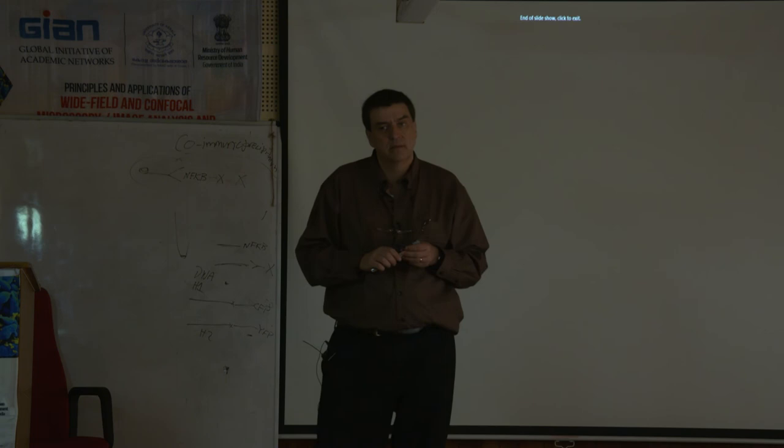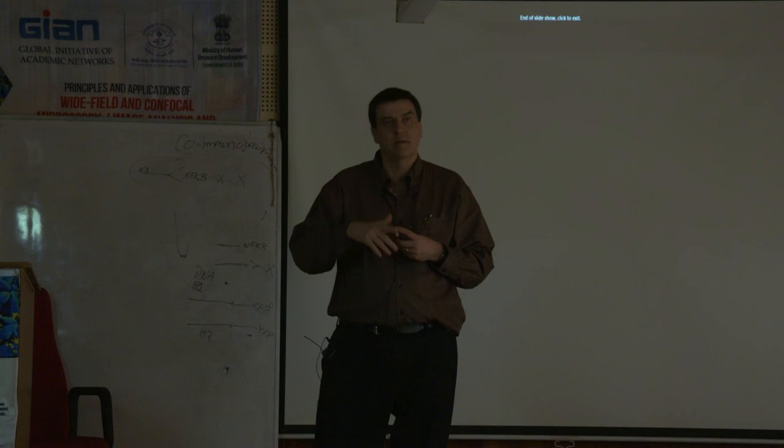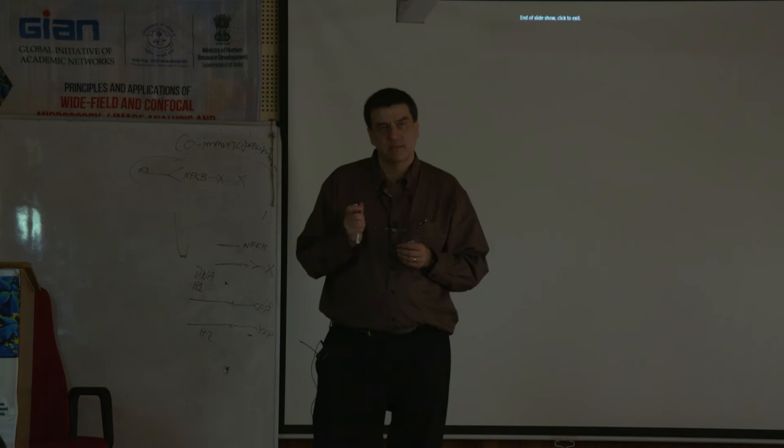Okay. But like I said, it's not trivial. You don't just say tomorrow, oh, let's do FRET. You really have to think it through. Out of all the techniques I've talked about so far, it's probably, in my personal opinion, the trickiest.